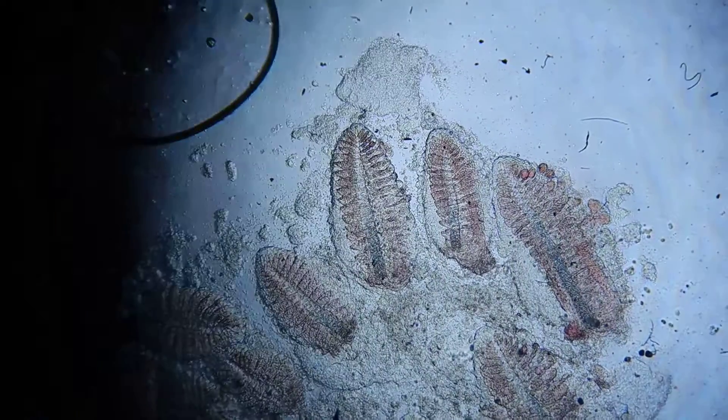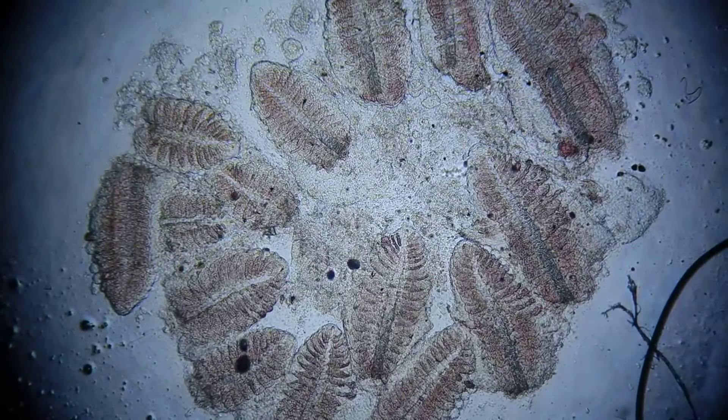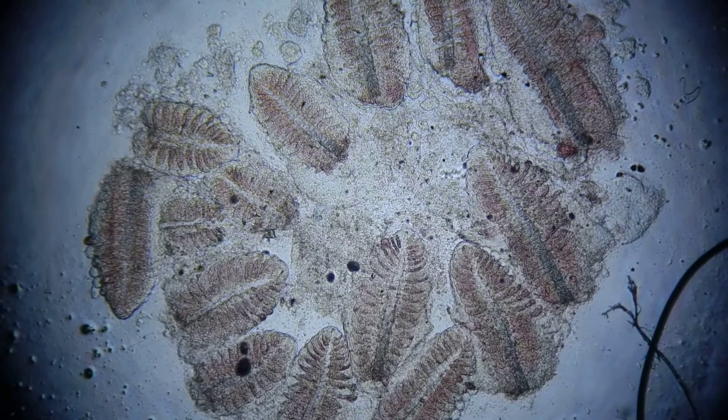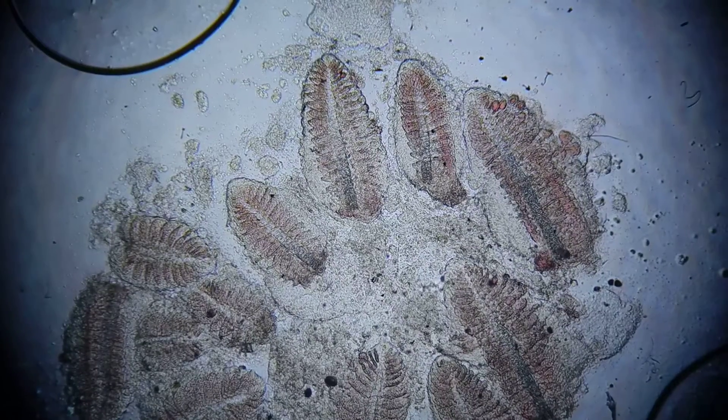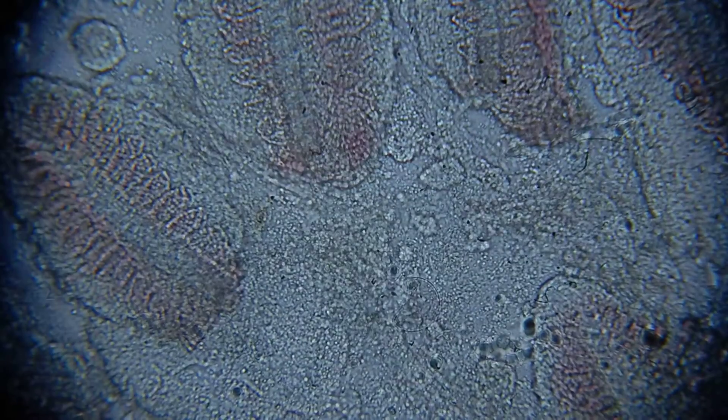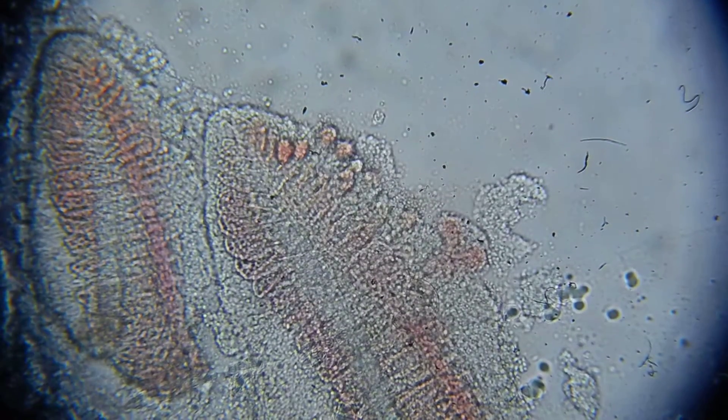And also when you are assessing gill health, look at the redness. Make sure that they are all filled with blood. Anemic goldfish would look quite pale. And also have a look to see if there's anything moving. So if there's anything moving, it's evidence of an external parasite. And it can be any one of a number of things.